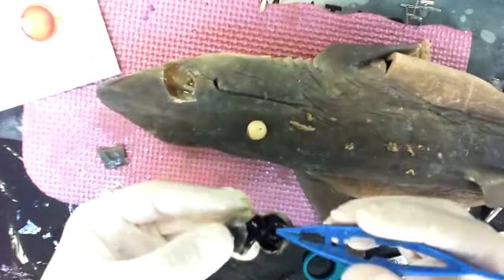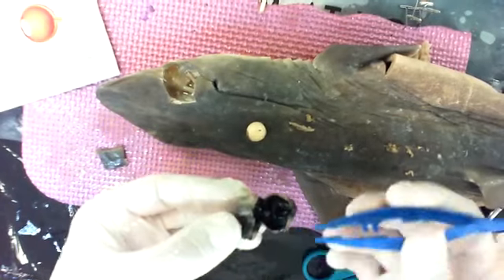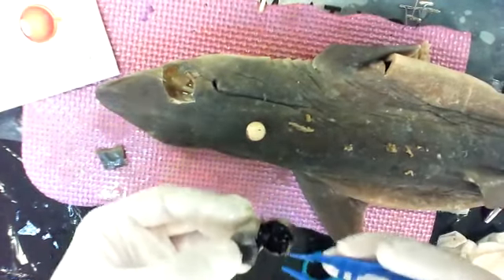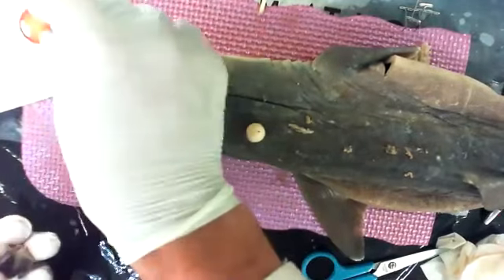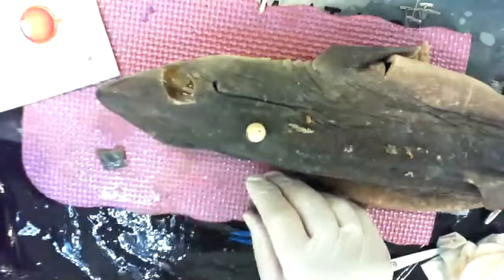Right? And then I can't really see it, but all the dark membrane on the back, that's where the retina and something called choroid is, which is blood vessels. And then the last thing is that reflective layer. So all the way in the back, you have that mirror layer of the tapetum lucidum. Way back here, that lets light bounce off and come back in.